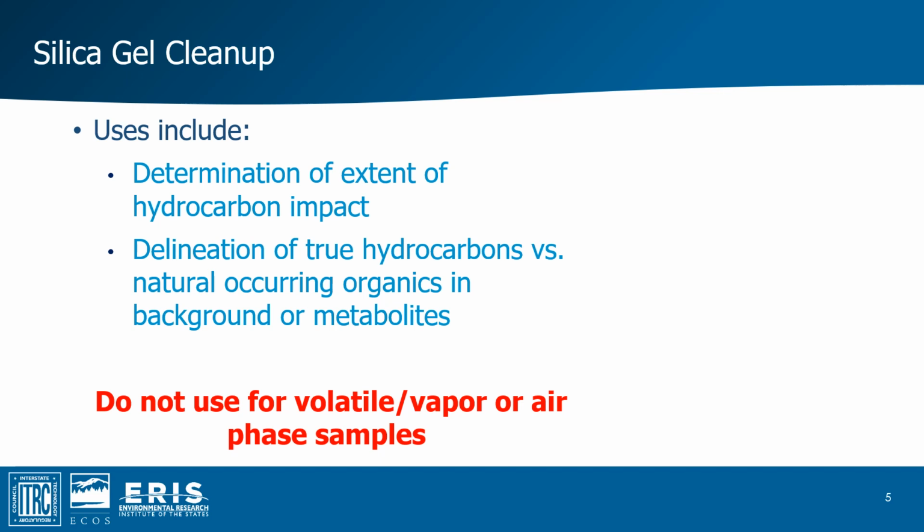One thing to be aware of with silica gel cleanup is that it will result in some loss of volatile phase compounds. Consequently, it's not considered appropriate for volatile phase or air phase samples. Currently, there is no cleanup method for volatile or air phase samples.